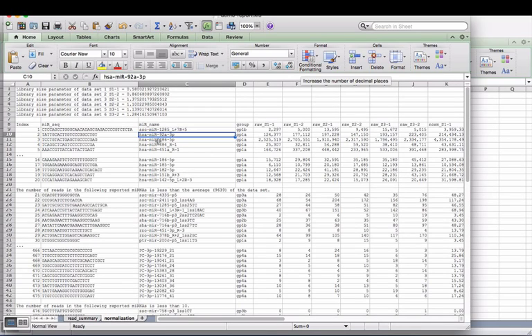And in general, when you go through the reads, you will also sometimes find reads, for example, for messenger RNA. This can happen simply because we do a size exclusion, of course, but if you have degraded messenger RNA, it can of course end up in your library, and that's why we filter for it.